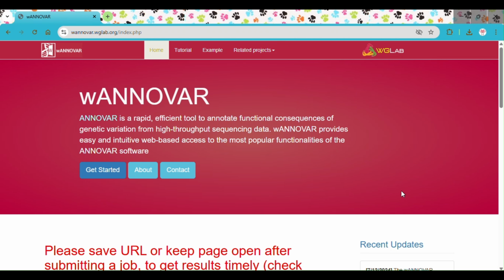In this video, I would like to show you how you can annotate your variant files using ANNOVAR software, which is an online web server and user friendly. You can easily use it. So last time we annotated our VCF files, your mutation files, using CGI, which is the Cancer Genome Interpreter.